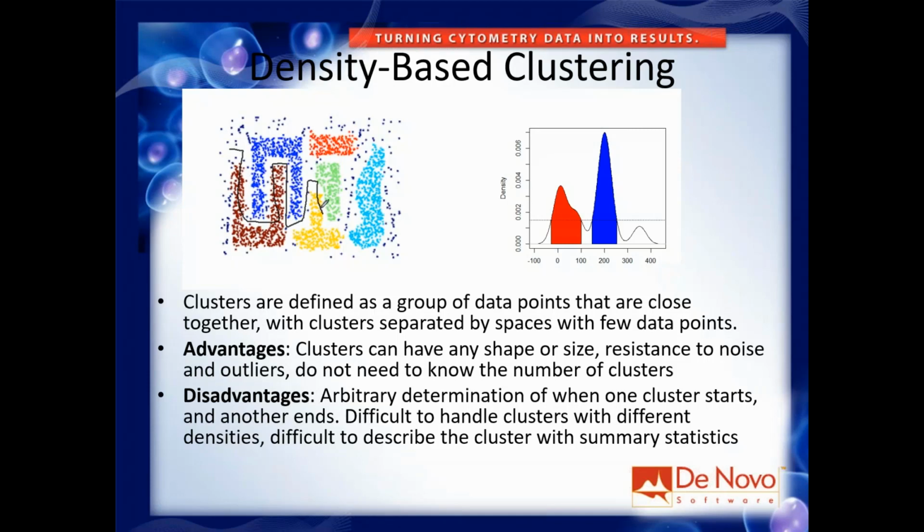Again, it's cool, it can work, it has advantages and disadvantages. The advantage is the clusters can have any shape or size. You don't really need to know the number of clusters because it just finds things based on dense areas. Valleys here, and then these are like mountains. So it just sort of tries to find the mountains in the data.